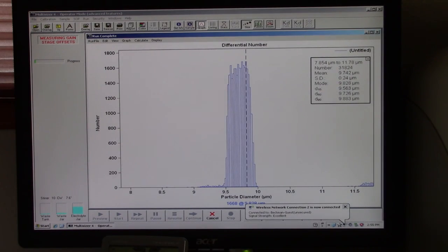And we're ready to press start. After the run is complete, you're going to see a distribution and response, much like the one you see on the screen right here. And this is what you're going to show to the customer to demonstrate the instrument's capability and its repeatability and accuracy.